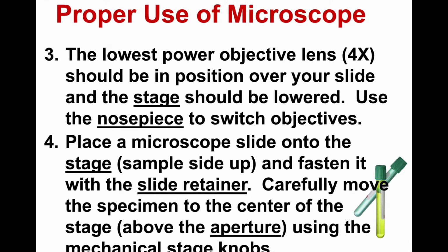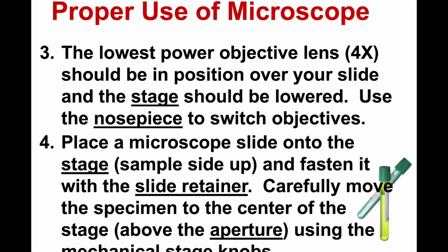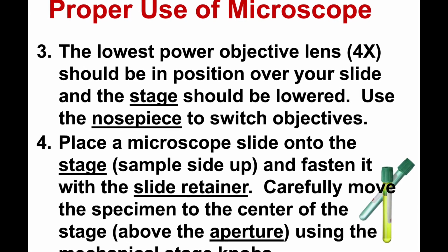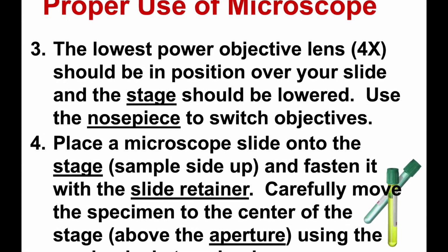Again, use the nose piece when you want to adjust to 10 times, 40 times, 100 times. Use the nose piece. Always hold your nose piece to change different objective lenses.